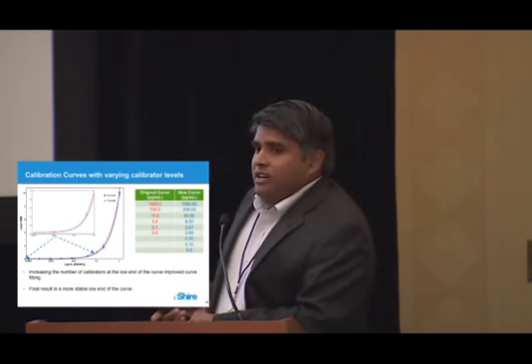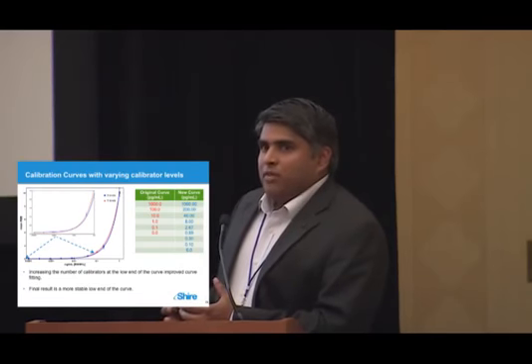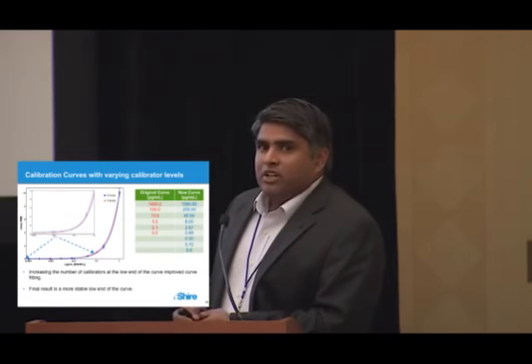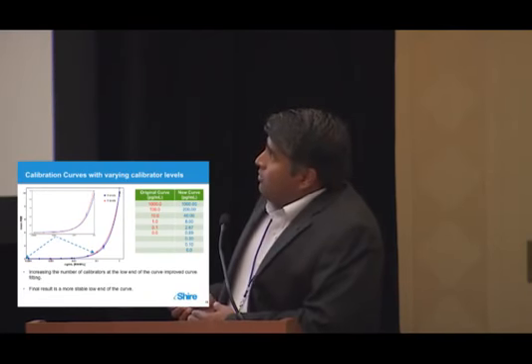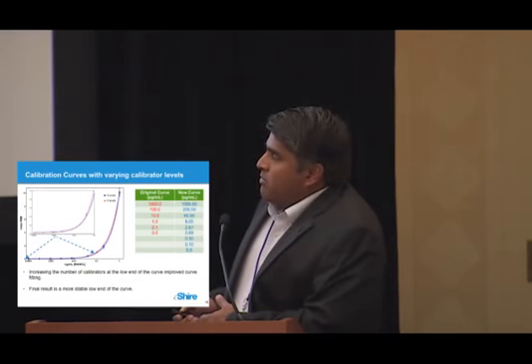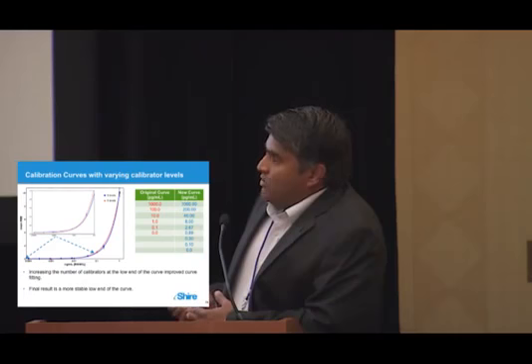As I mentioned earlier, at Shire we develop an assay and pre-qualify it and send it out to a CRO for full validation. We picked Frontage Laboratories as our CRO to validate this assay, and right now we are in the process of assay transfer. For pre-qualifications, we tested MRD, that is for matrix effect, as Ralph was talking about, assay precision, and parallelism. I'll go into more details about some of these. I'm going to mostly talk about the top 4 because of time limits.